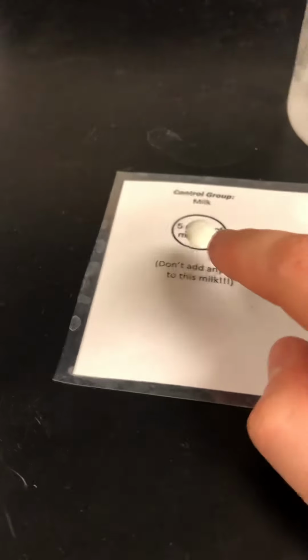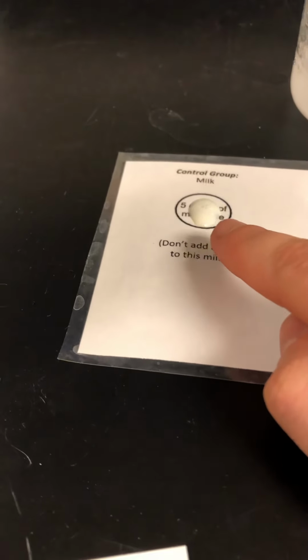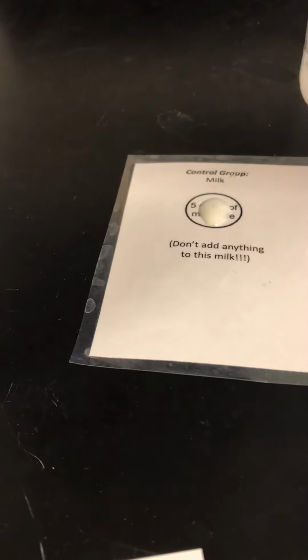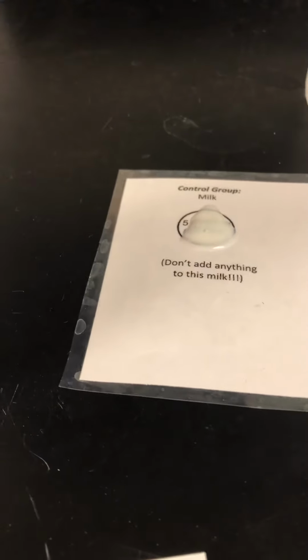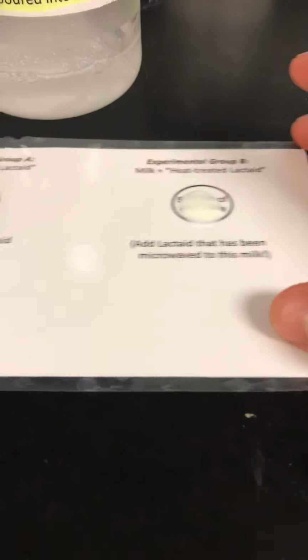So if we wanted to, we could add some plain water to this, like 5 drops of water. I've got about 5 drops there. There we go, just to dilute it and keep our controlled amount. I forgot a dropper. Okay, so there's our control. We could just add regular water to it, or we could just leave it as is.